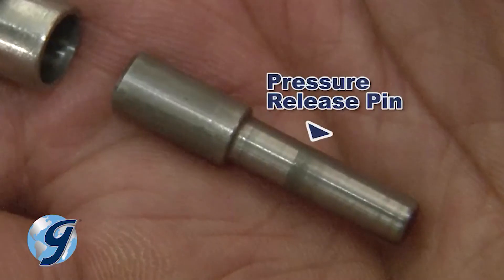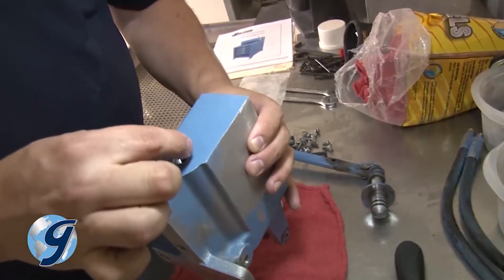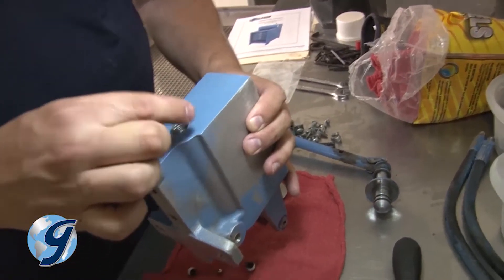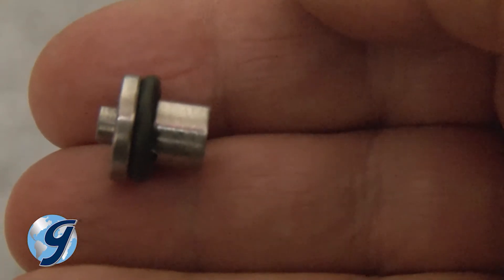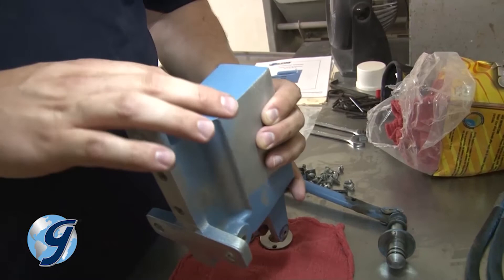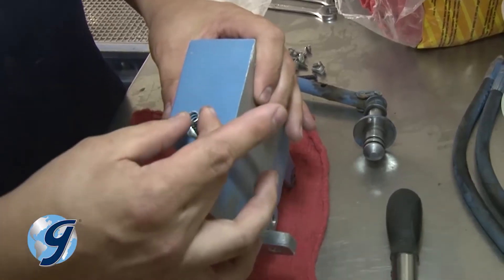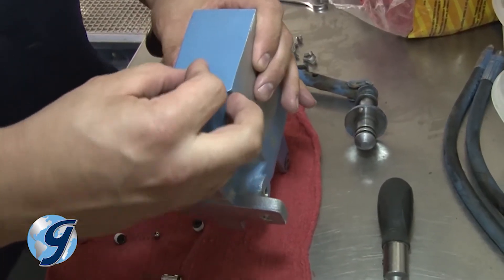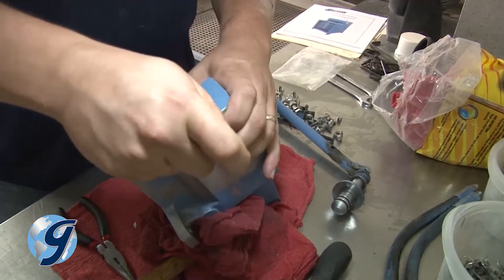Now insert the smaller portion of the pressure release pin into the pump housing. Next, fit the O-ring on the larger diameter portion of the pressure release thrust pin before inserting it into the pump housing around the smaller pressure release pin. The cone-shaped spring is then installed with the narrow end facing inward toward the pump body. Finish by installing the new plug.